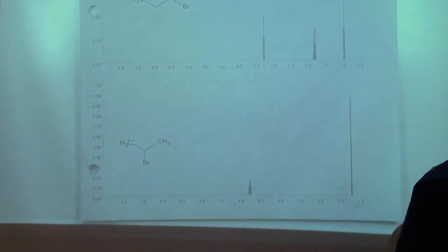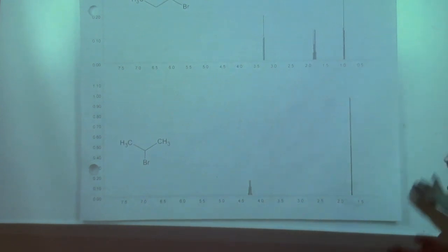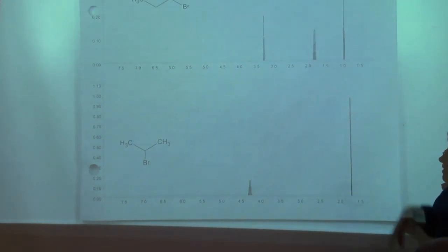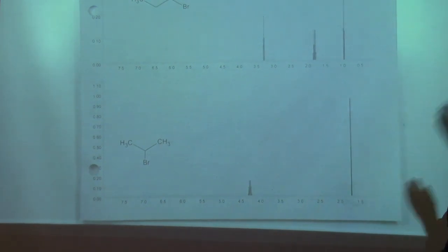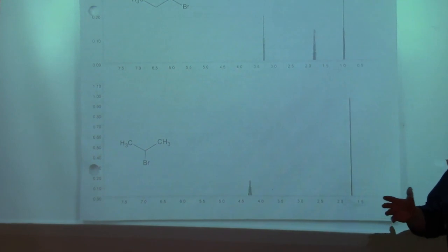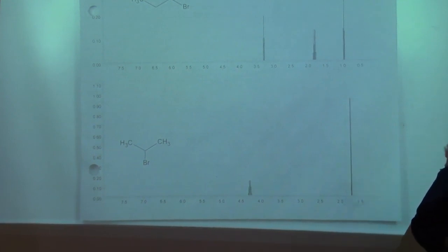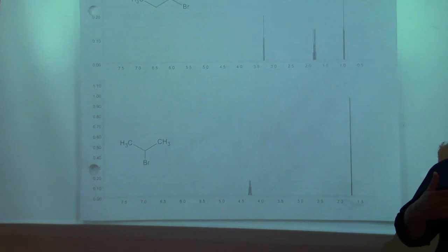And so the question becomes, where does that come from? Why are some 2 and 7 and 6 and 3 and 4 and 1? Where does that all come from? Well, that comes from a very specific place, and what the pattern is is really the idea behind splitting patterns.